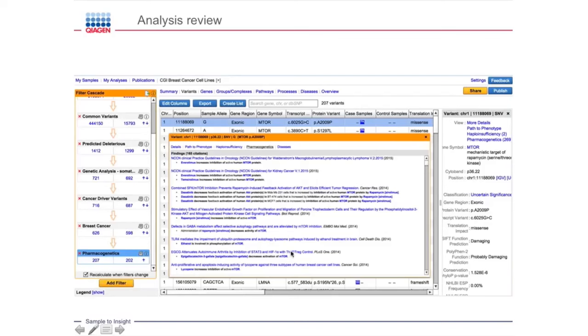We have also now incorporated the PGMD database. So starting end of August with the new release, you'll also see information from PGMD incorporated into your pharmacogenetic findings. And by clicking on these links, you can go and read the primary publications.